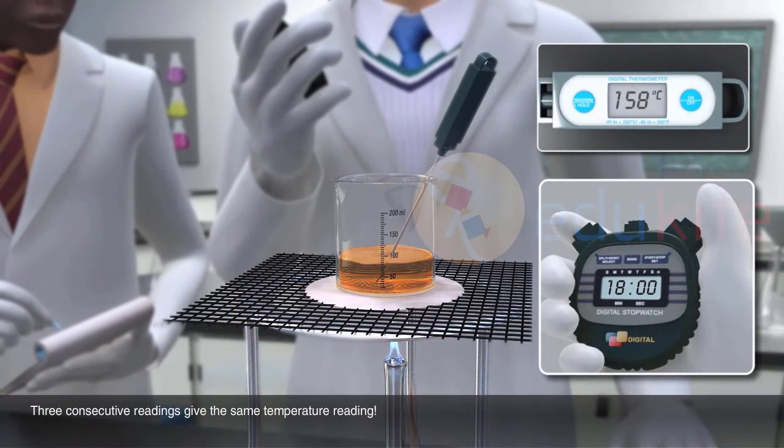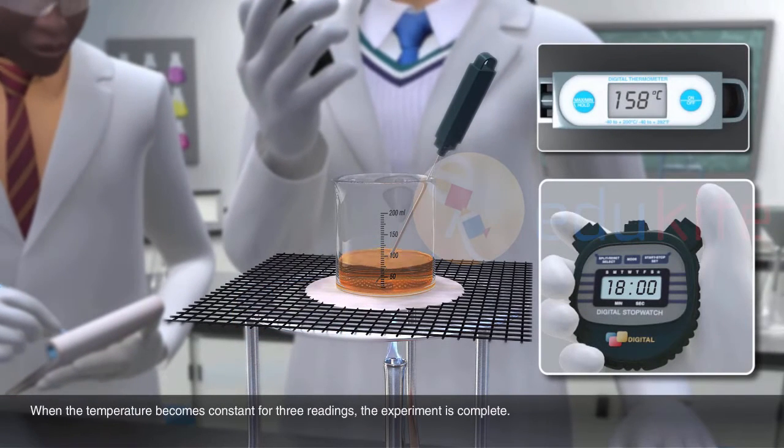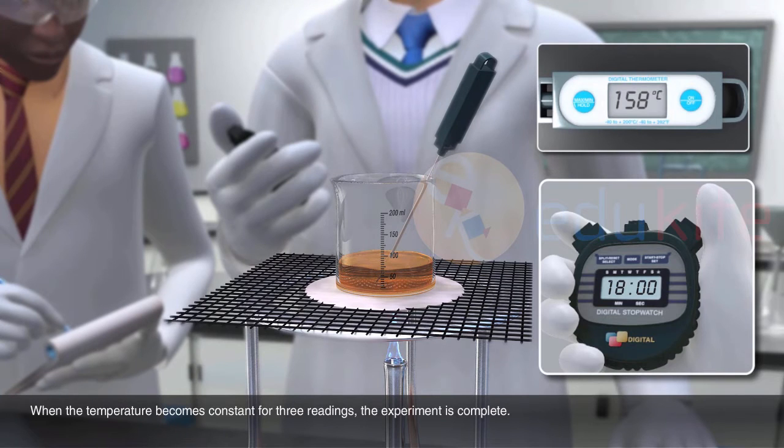Three consecutive readings give the same temperature reading. When the temperature becomes constant for three readings, the experiment is complete. The apple juice has almost boiled off.